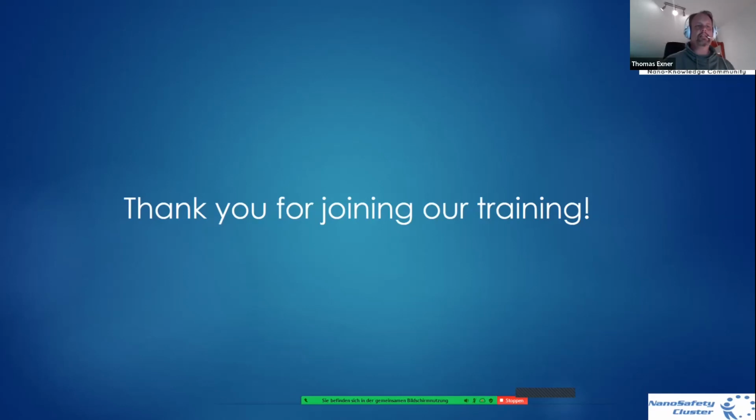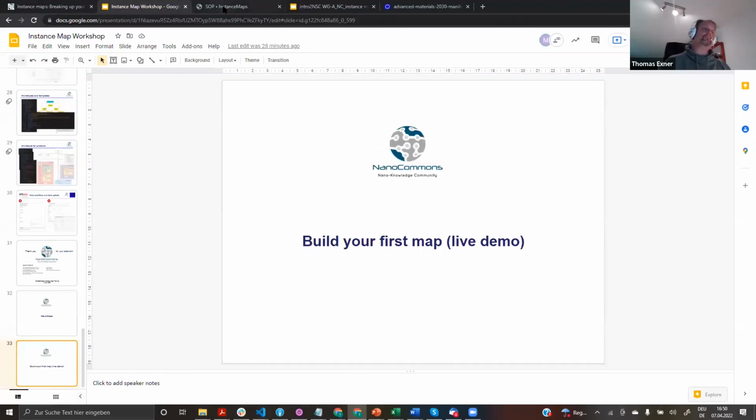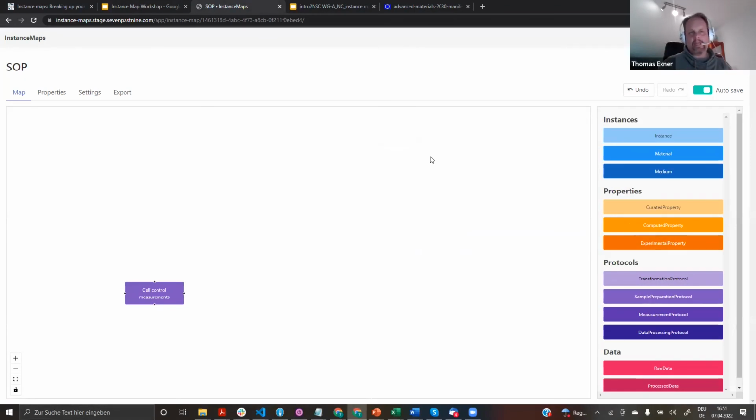There are some little things which I could quickly show, things which might be frustrating, or perhaps just not clear what they actually mean. This is mainly when you start putting properties in. I think the main part is quite simple. You have these different types here. You have to be a little careful that you really see this cross when you start putting connections from one to the other. At the moment, you can connect everything to everything.